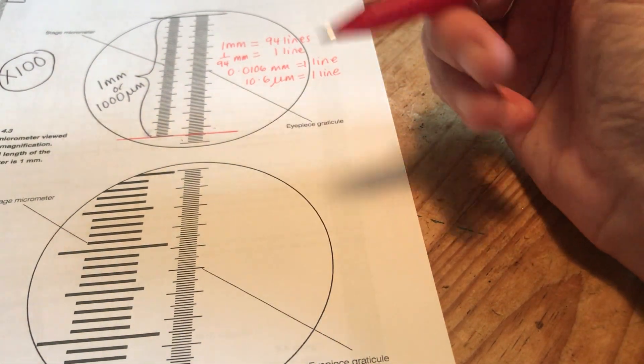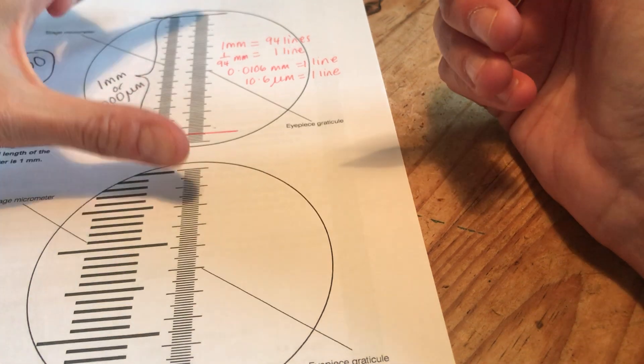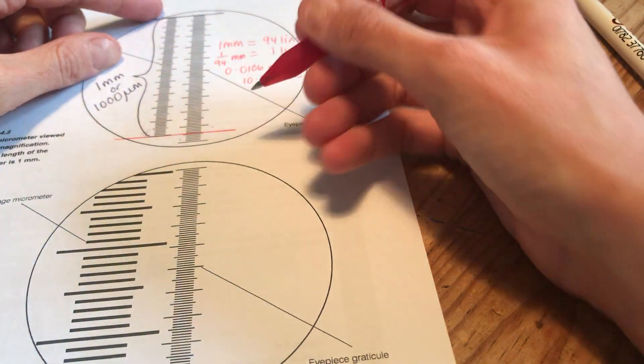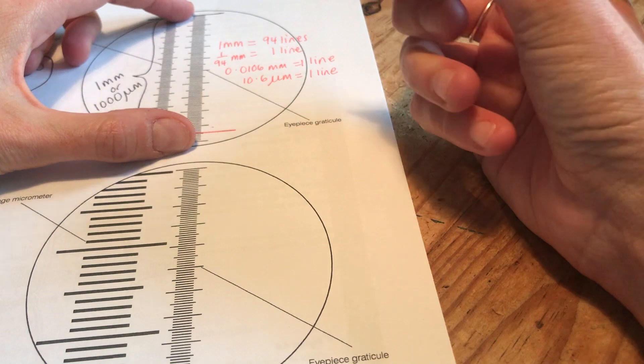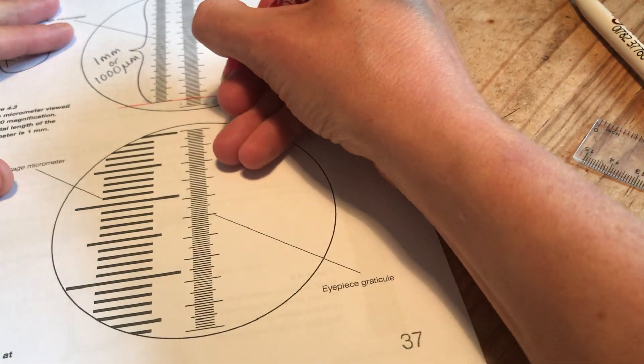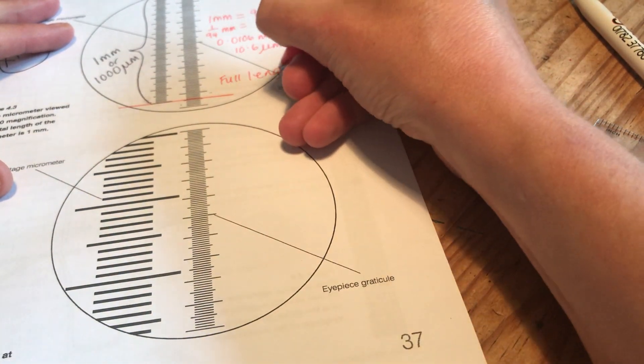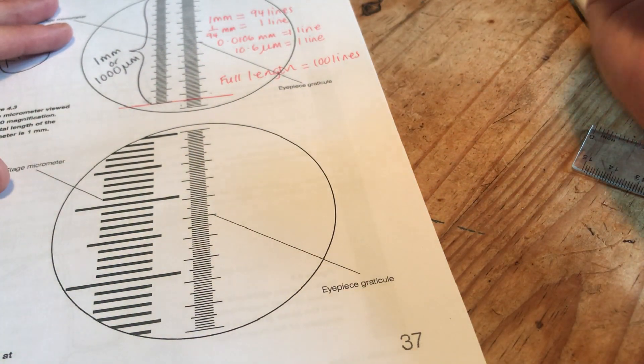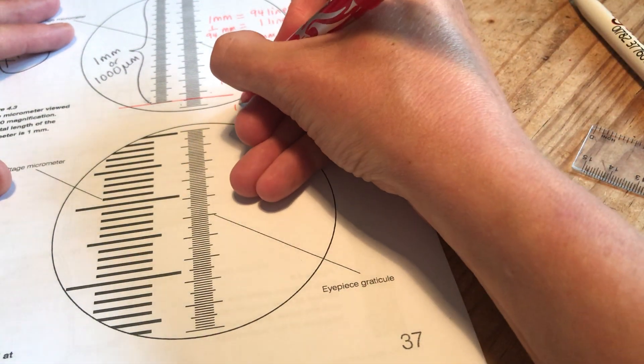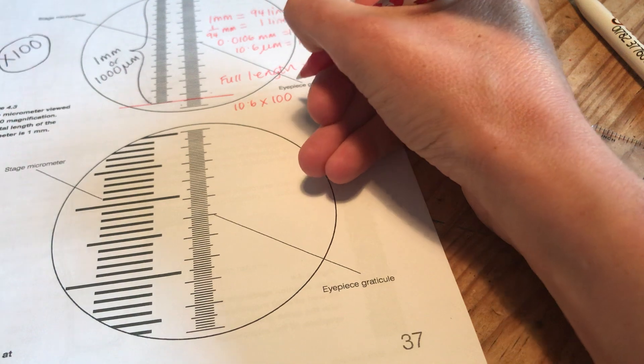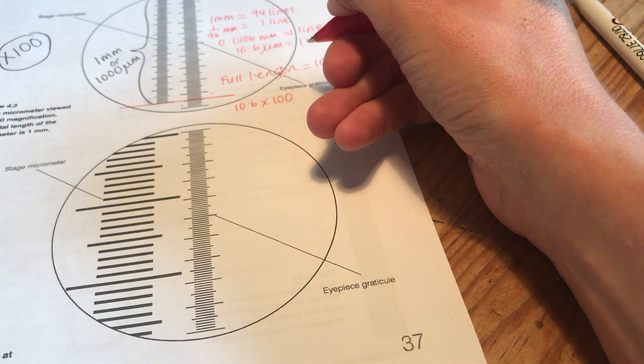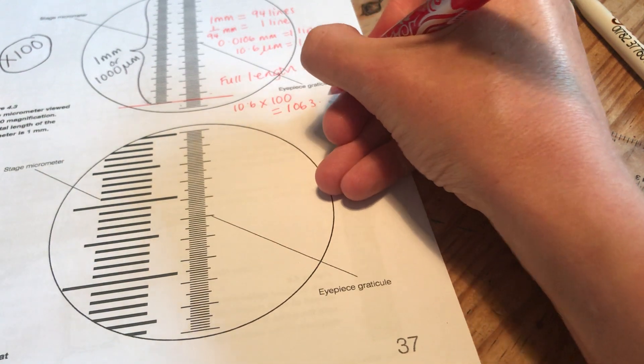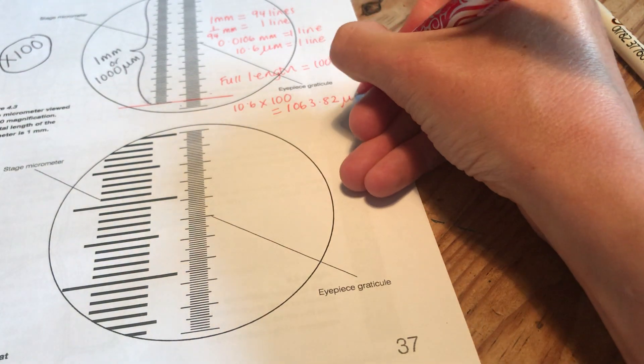Then it says now calculate the true length represented by the whole of the eyepiece graticule. Well the whole of that graticule there is not just 94 lines there's 100 little lines in there. So the full length is 100 lines. Each line is worth 10.6 micrometers. So 10.6 times 100 will give me the answer of 1063.82 micrometers.